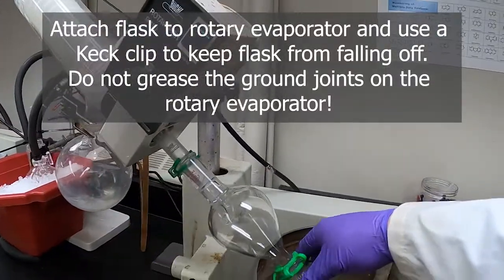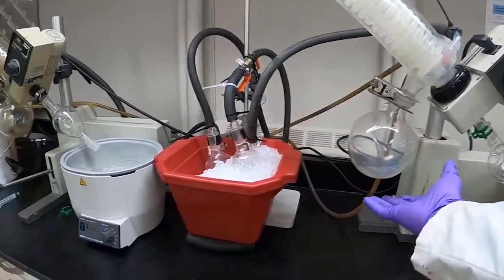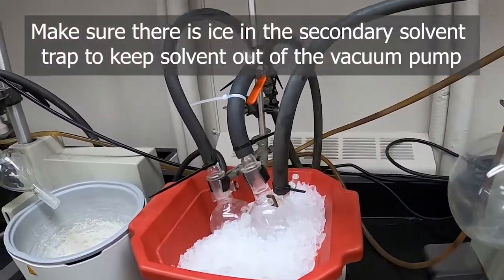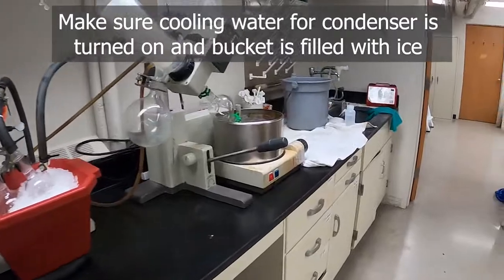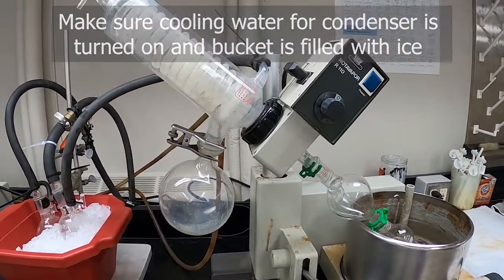So this here is a water bath, which I've got set to about 35 degrees. We'll be collecting our solvent in here, and we'll want the solid that will end up in there. This is a trap here to protect the vacuum pump from any fumes. And then over here I've got a bucket with water for the recirculation for the coil here for the solvent to condense on.